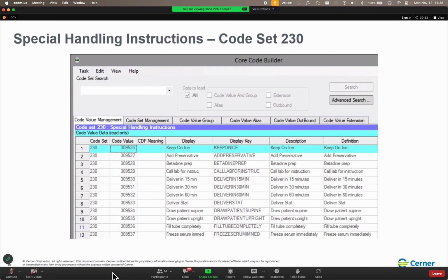So next up, we've got time study. Now, folks, time study, remember, very important to go ahead and be collected at exactly that time, not late. But different sites will call time studies different labels. So we can't go on the label and say, oh yeah, that's a time study. So what we have is a checkbox that says, I don't care what you call it. If you want me to treat it like a time study, you have to have the checkbox selected.